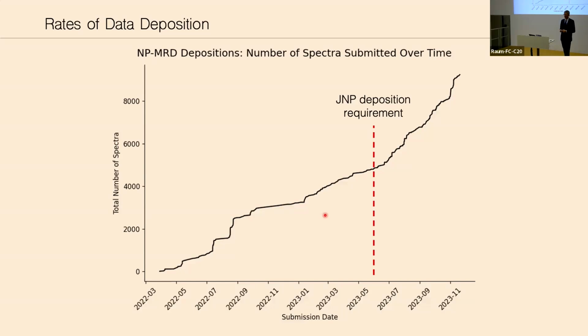And we get, it varies a lot, but sometimes as many as 100 spectra a week. Way more spectra than we could get by going and asking friends and family for depositions and to put data in. So, in the long term, I think it's a really good way to do that. But still, the uptake is not as strong as it should be. And I think there's a lot of work to do to convince people that it's for the collective good that we should do it, and that there is some sort of return on that investment for people individually as well, whatever that might be.